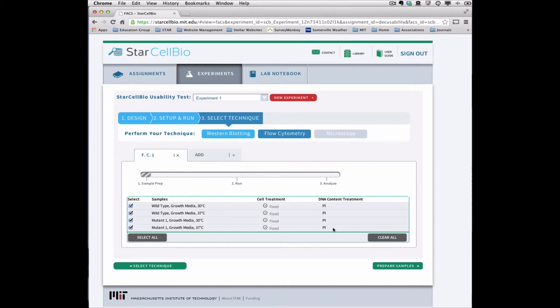Once you have selected all of the samples you would like to prepare, click Prepare Samples.